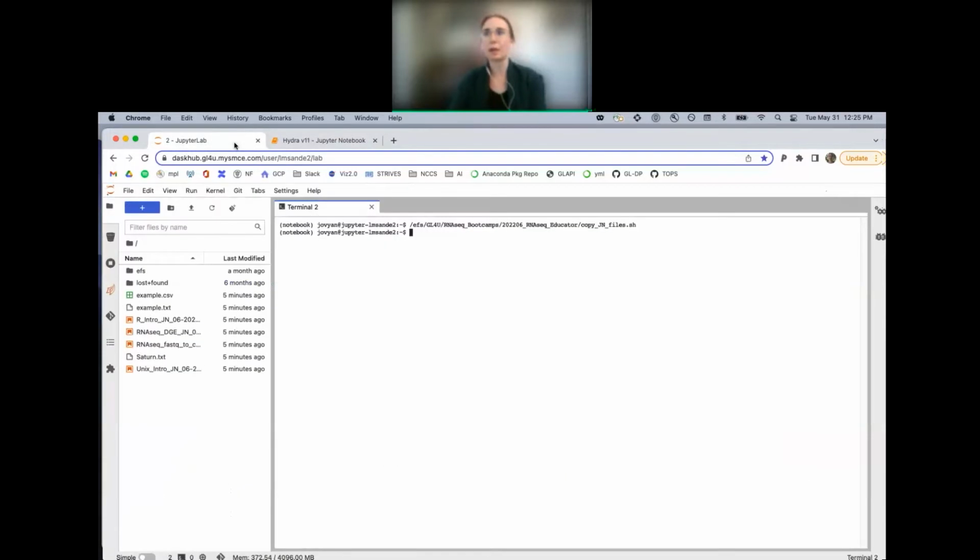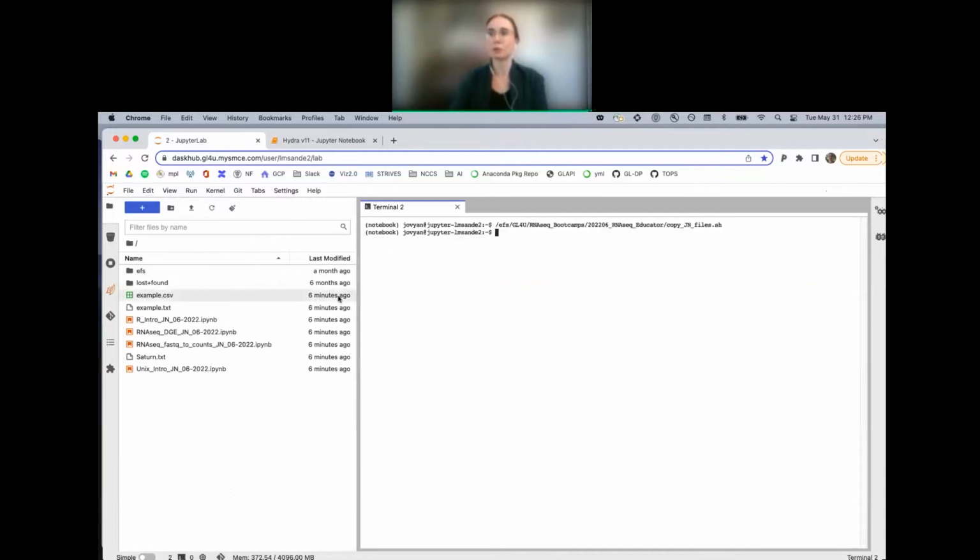Then after Jupyter Notebooks were developed, there was a new innovation called a JupyterHub, which is a place where many people can log in, like we all just did. We can all access the same notebooks and the same code. So that's what we're doing here. This is a little different from just having a standalone notebook. We have an actual file tree that we can all interact with and see lots of files there.